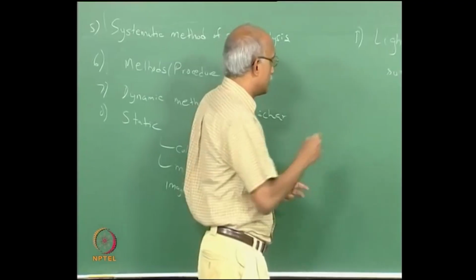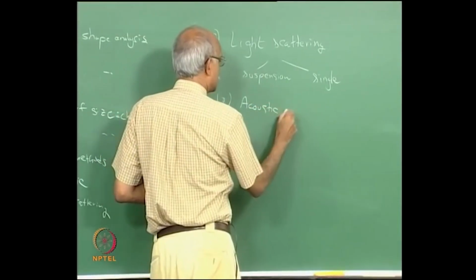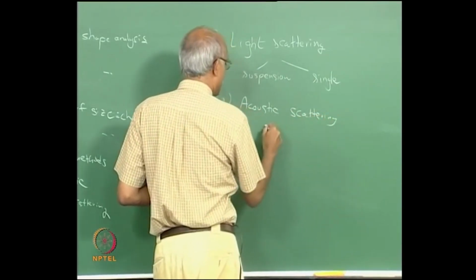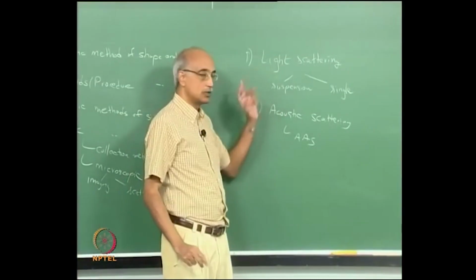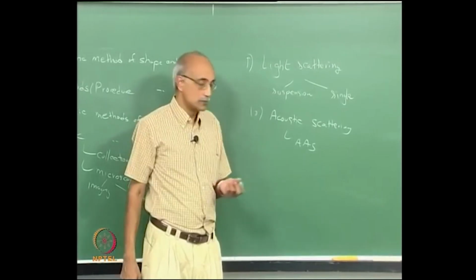And then we looked at acoustic scattering methods, in particular the acoustic attenuation spectroscopy technique. Again, the key difference is that the light-based technique is suitable for dilute suspensions and the acoustic technique is suitable for concentrated suspensions.